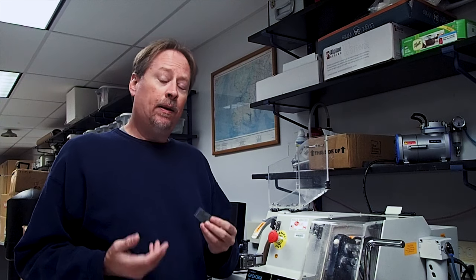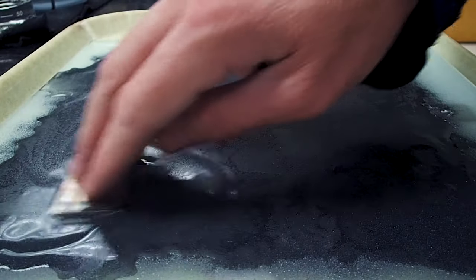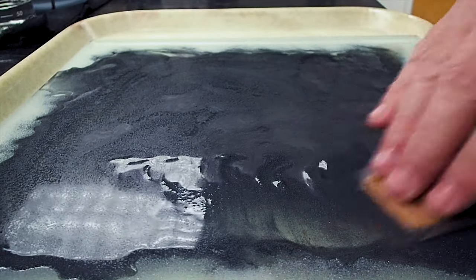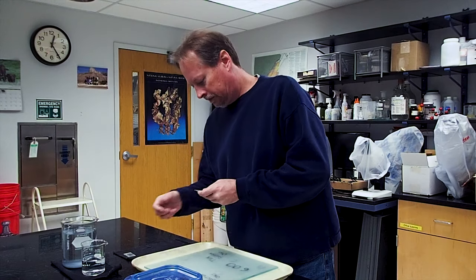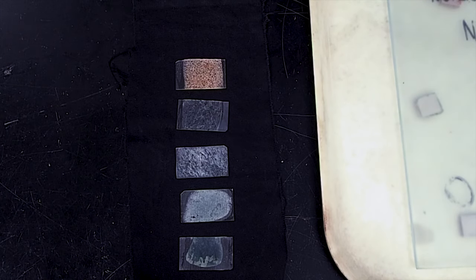Similarly, if you were grinding and polishing by hand, the same technique using glass plates and powdered grits may also be used on your cut-off thin section to grind it down to its final thickness. Once you've retrieved your thin section from the cutoff saw, you can use the glass plates and, starting with a 120-220 grit, begin to remove rock from your slide, eventually moving to the 400 and 600 grit sizes as the sample thins and approaches a final thickness of 30 microns.